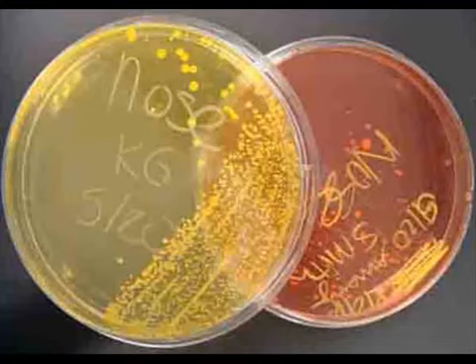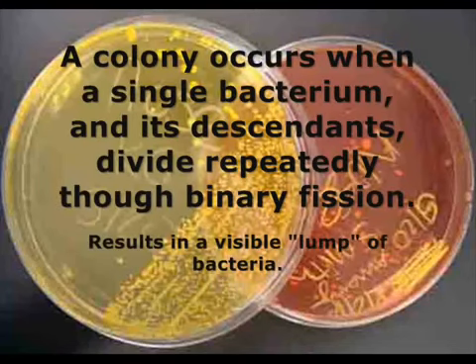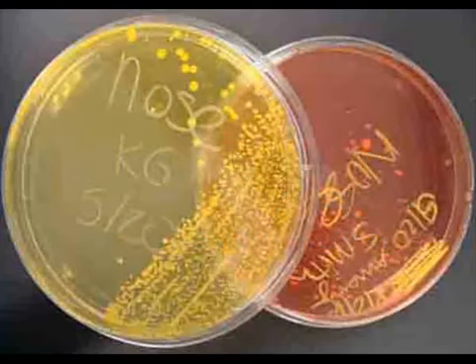I can also sometimes get additional information about the bacteria growing on my plate by looking at their colony morphology. Colony morphology refers to what each different type of bacteria looks like when growing in a visible colony on the surface of the agar. When I look at the colony morphology of the bacteria growing on the left plate, I see two main types of bacteria.